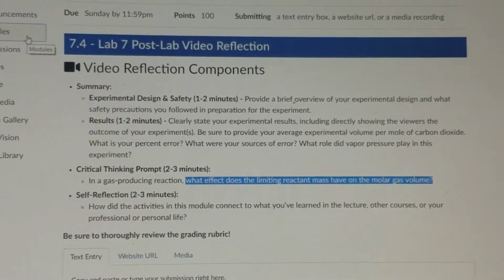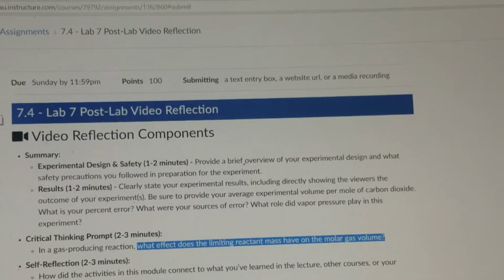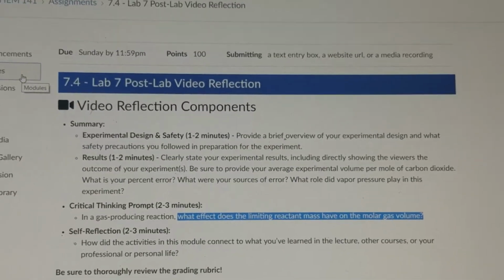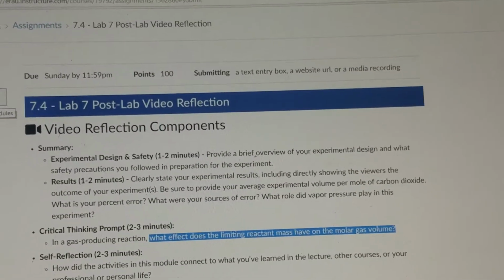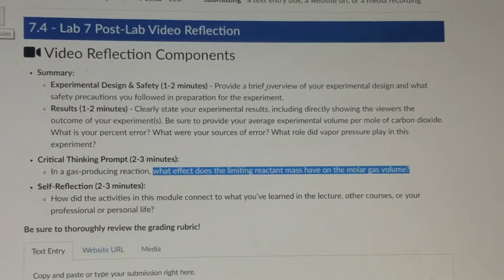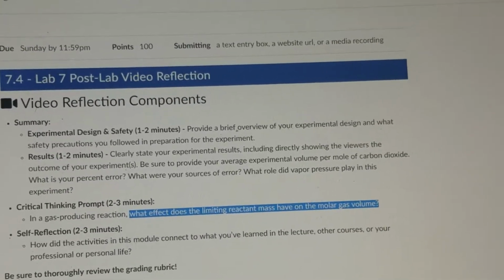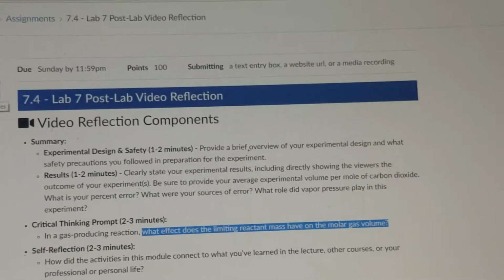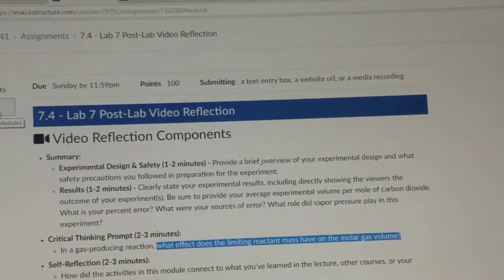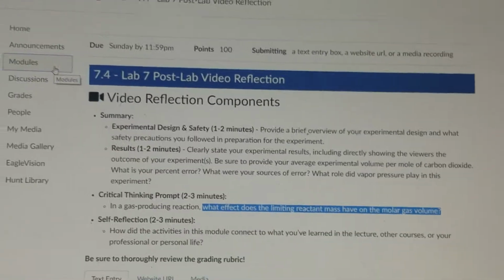And since the experiment is carried out under the same conditions, that is, the temperature has never changed, and the barometric and atmospheric pressure have not changed, the amount of the chemical or limiting reactant used in this experiment is highly critical, because it completely determines the amount of carbon dioxide produced, and it will in return displace the water, so that will affect the result of the experiment.